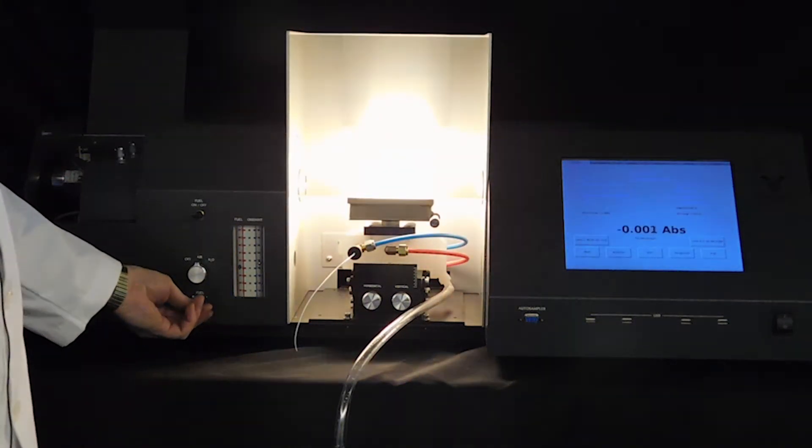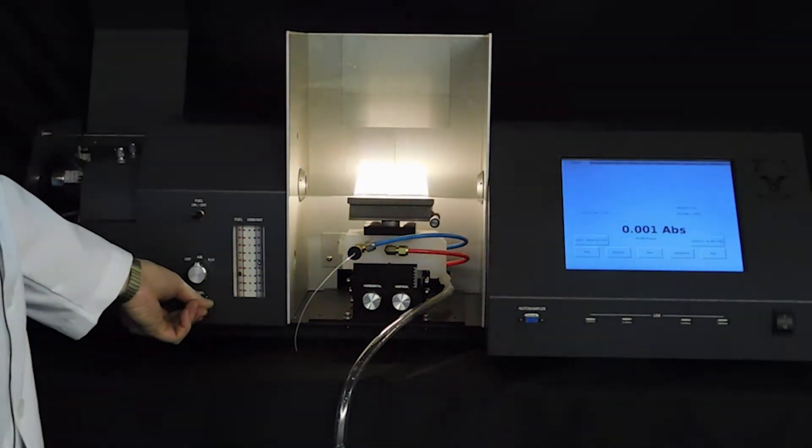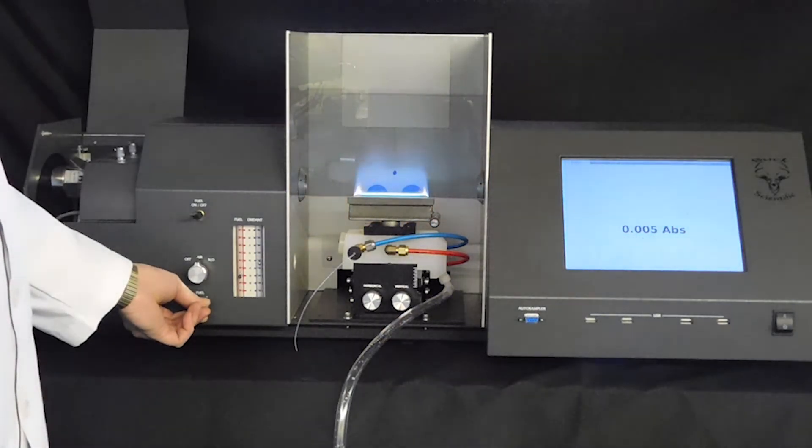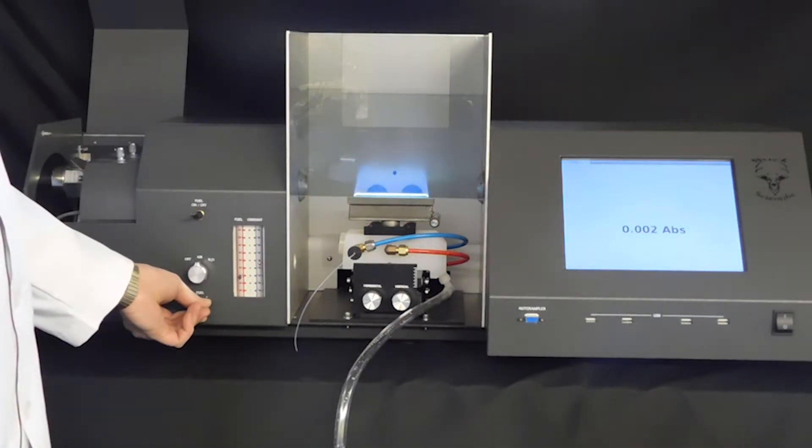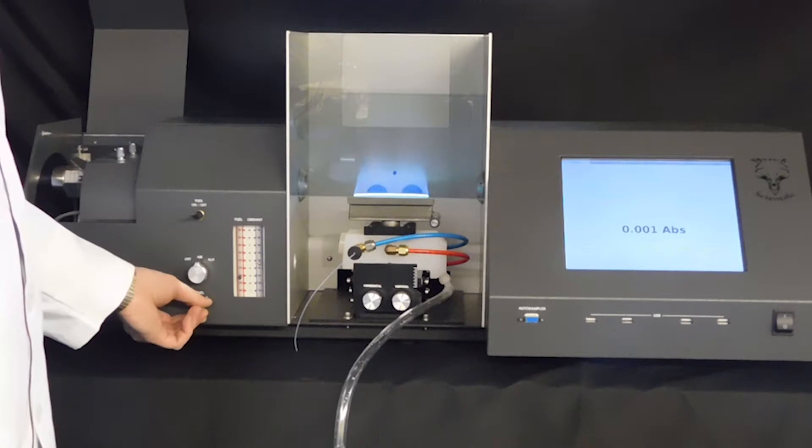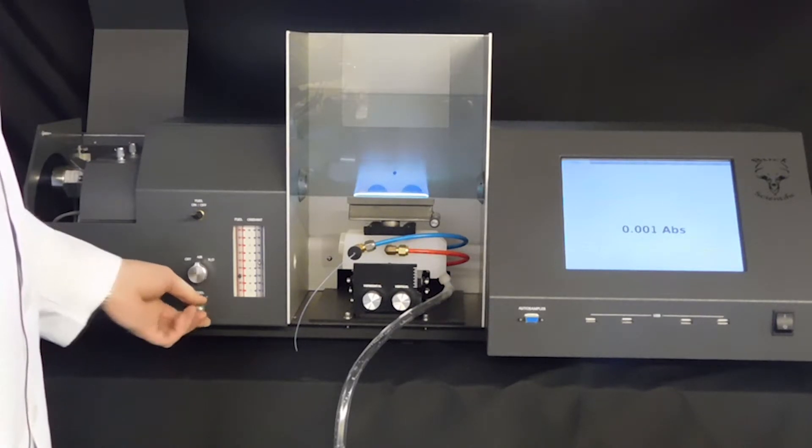Adjust the flame so that it is all blue. Some analysis require different settings. Check your manual for the correct setting.